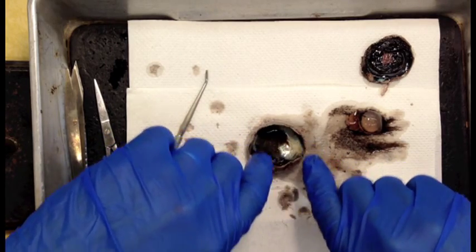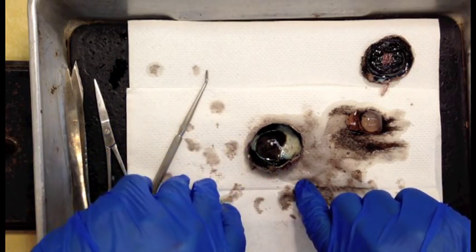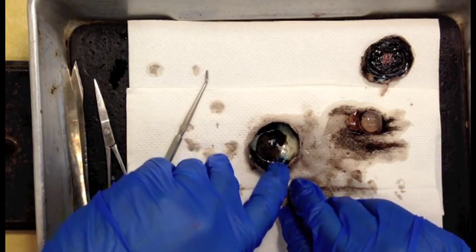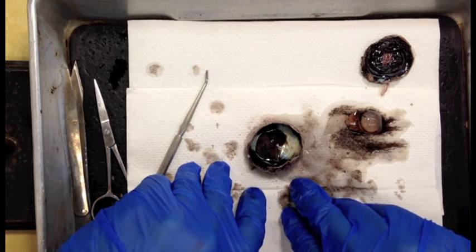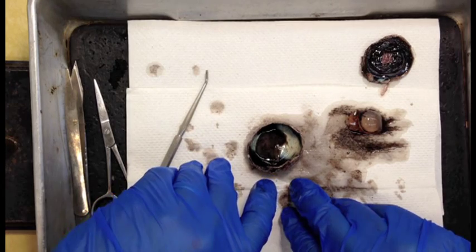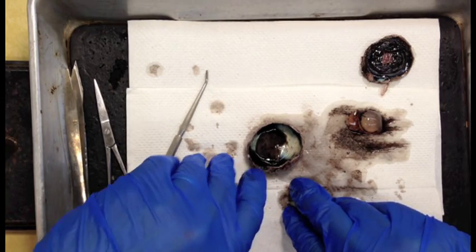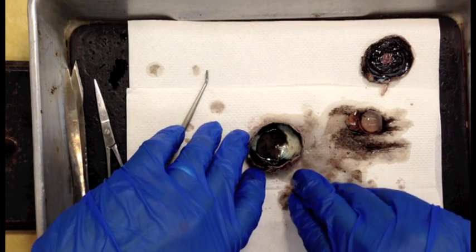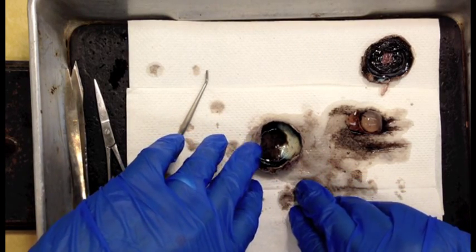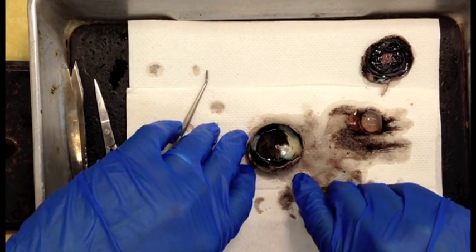But in the cow eye, there's actually this sort of iridescent blue-colored layer. This is a reflective layer, and this can be exposed or covered depending on the light conditions. So in low light conditions, like at night, this reflective layer can be exposed so that any light that passes through the photoreceptors and doesn't stimulate them gets a second chance at stimulating photoreceptors. So although you get slightly blurry vision, you can still see. But we do not have this reflective layer in our eyes.